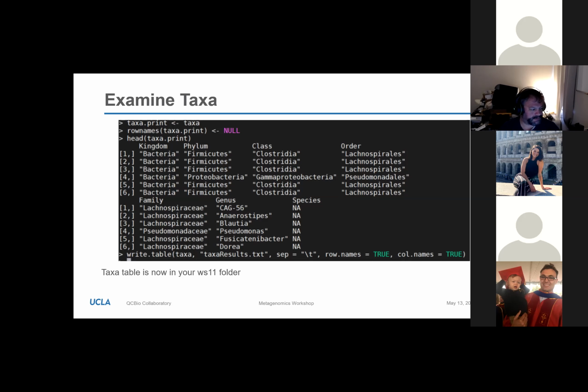Michael? Yes. I just had one kind of general question. Obviously, I noticed you're using R, and I have been really used to using Python and using my Conda environments for that. Do you suggest using R or Python for different types of analyses that you're running? Does one kind of work faster than another? Actually, my preference is Python. Okay.